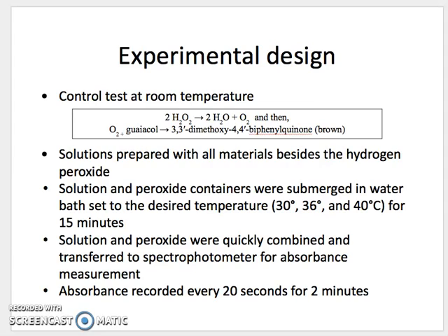We had 4 different conditions at 4 different temperatures, 24, 30, 36, and 40 degrees Celsius. For each condition, we did 3 tests for a total of 12 measurements. Each measurement consisted of the same amounts of each reactant, which served as our constant.